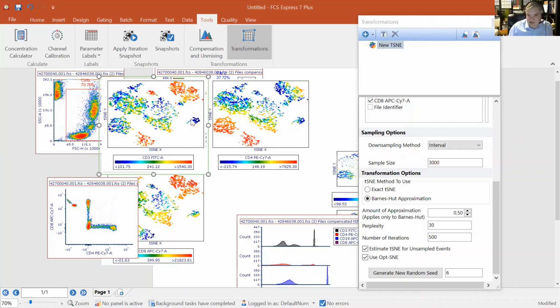So this cluster is obviously very different from this one. It's in a different space altogether, so they're not at all related. But in the same way, if this is a cluster here and this is a cluster here, just because they're this close to each other doesn't mean that they're related. But at some point it does become a localized cluster, right? An event that's right next to another event, of course, is part of that cluster.